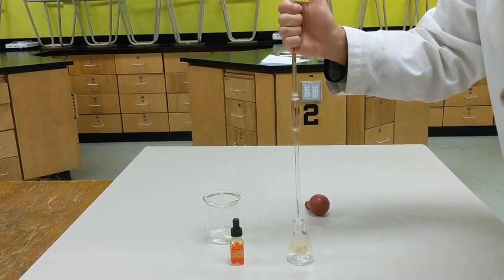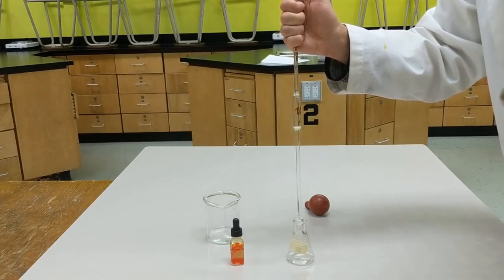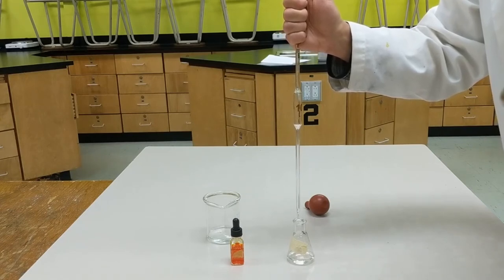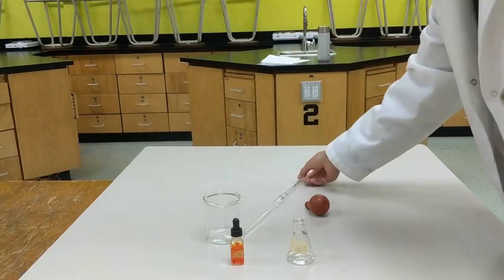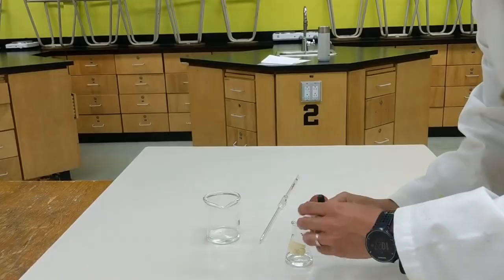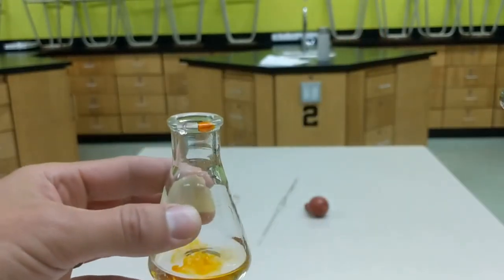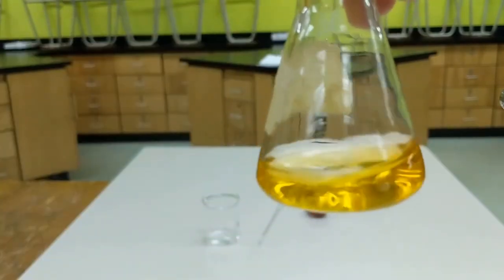Once we've got our proper 10 milliliters, just let your thumb off the top of the pipette and drain it into the flask. This will be for one of our trials — it takes a while. You do not want to put the bulb on and force liquid out. Pipettes are calibrated to retain just a small amount in the tip. I'm adding the indicator now — two drops — and swirl it around. We should get a nice orange color to begin with.